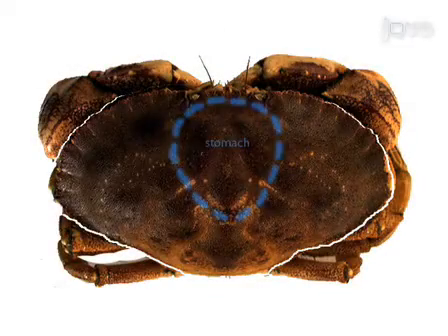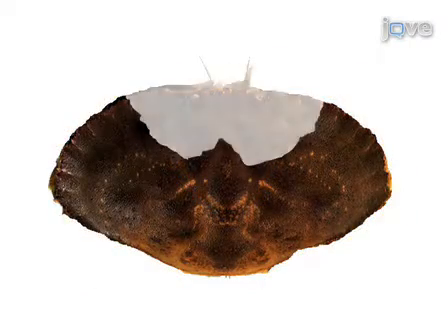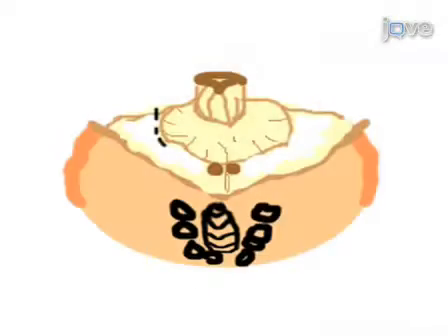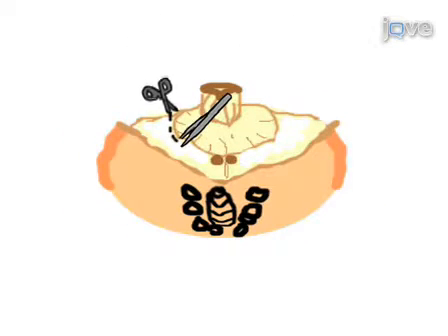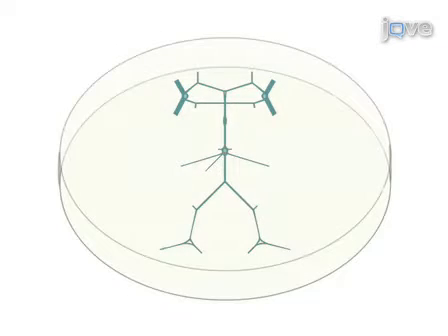This procedure begins with a gross dissection of the crab stomach in which the appendages and dorsal carapace are removed from the crab. The entire stomach is dissected from the animal. The stomach is cut open and pinned flat to a black silgard dish in preparation for the fine dissection. The stomatogastric nervous system is dissected from the stomach and is transferred to a clear silgard-coated petri dish where it is desheathed in preparation for an electrophysiology experiment.